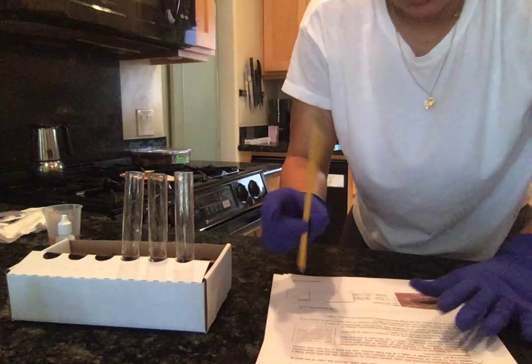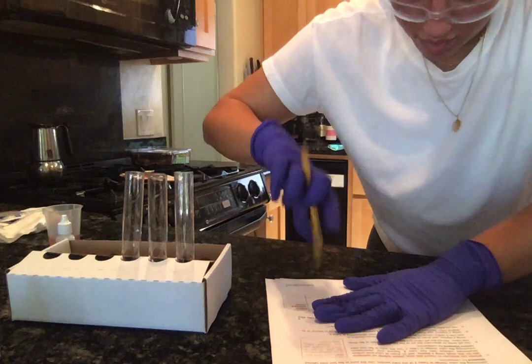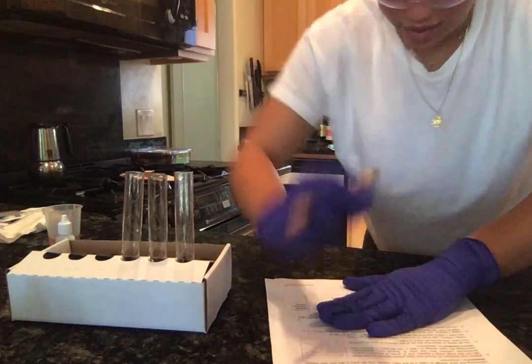So now I'm just gonna record that. It's yellow, not pink anymore.